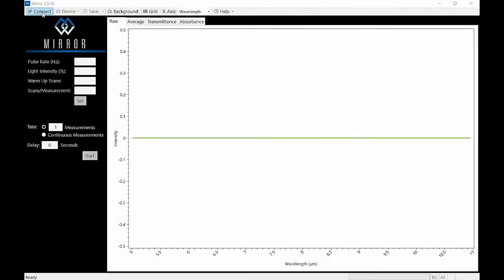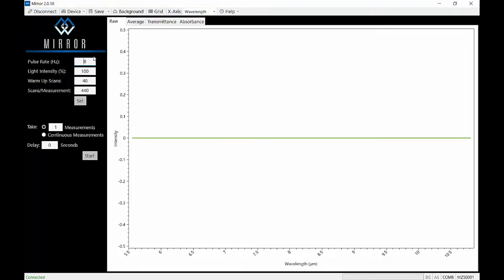Now for the fun part. Click the Connect button in the OceanMirror software and your MZ5 will automatically connect to the software. You'll know your MZ5 is connected when a recommended set of measurement parameters loads in the software window. You can adjust these measurement parameters according to your needs — the settings that load are optimized for most measurement uses.